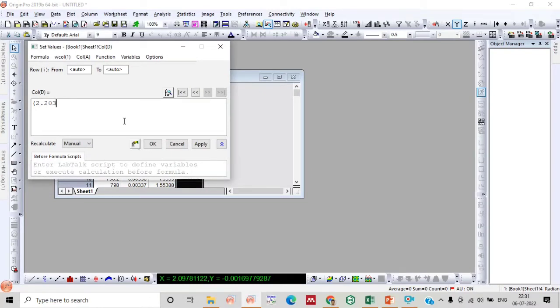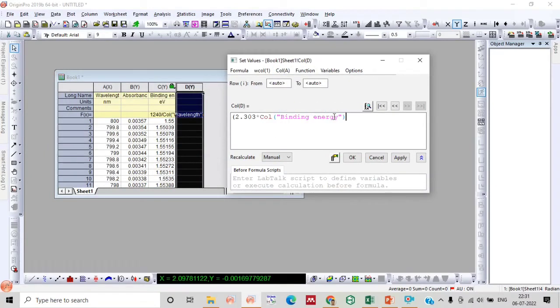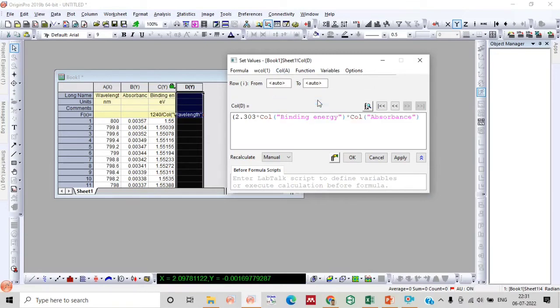Now select column D and go to set column value. In the bracket we need to type 2.303, multiplied by column C, again multiplied by column B, and then raised to the power of 2 — squared. This will give you a direct bandgap.